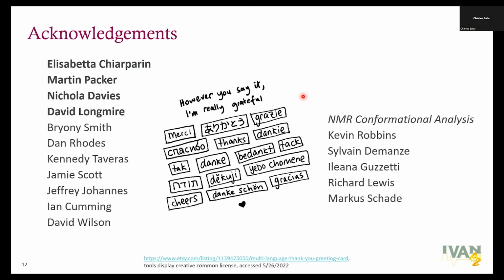Yes, so Amber, hi, thanks for the nice talk. I just wanted to confirm that the 3D bioactive conformation that you have used in some of these comparisons, did it come from the X-ray crystal structure of the protein with the ligand shown, I guess? Yes, that's a great point.